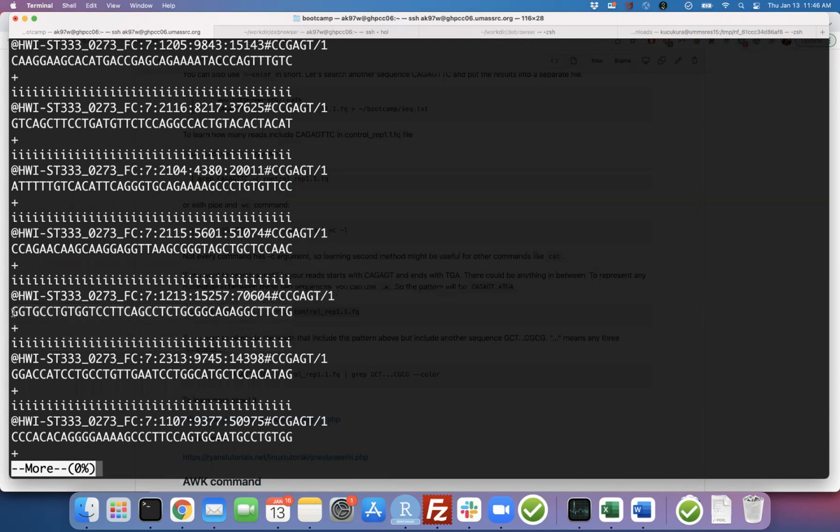For each nucleotide, we're going to talk about the quality, and that quality will tell you the accuracy of this sequence nucleotide, meaning how accurate that C is. If the accuracy is low, we're going to have this symbol here. If it is high, we're going to have that information, and we're going to show you how you can actually run QC.